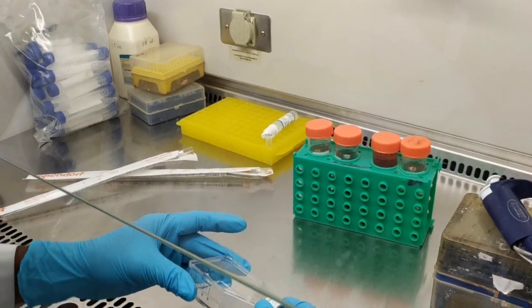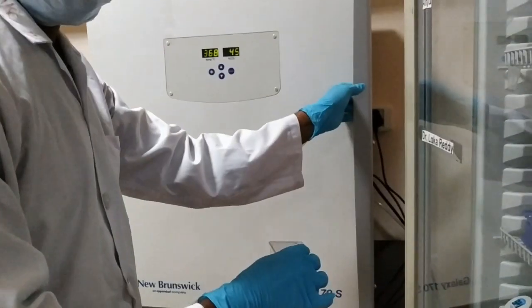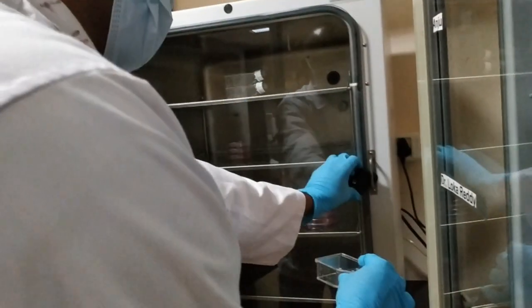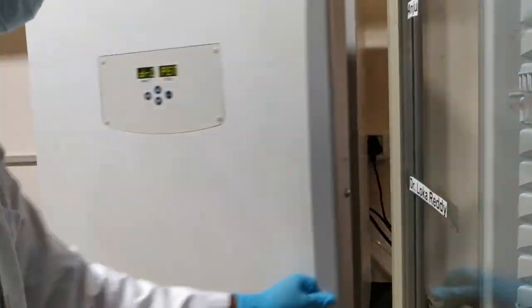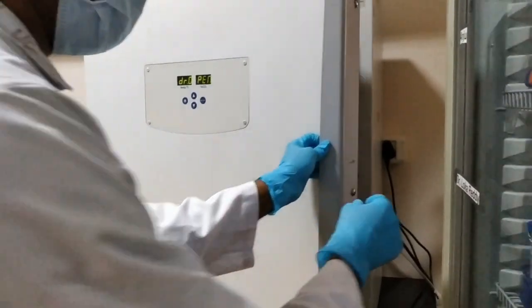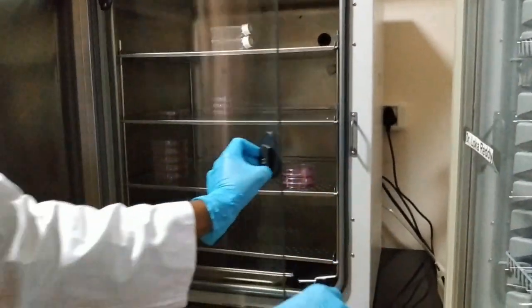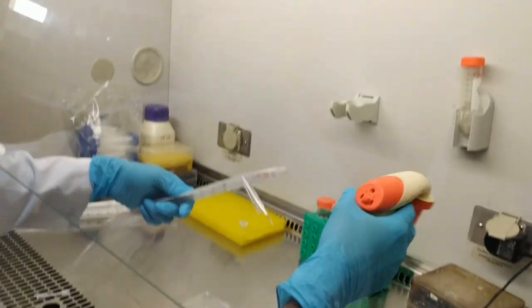To increase the dissociation efficiency of the trypsin, the optimal temperature should be 37. Hence, I am keeping the cell containing vessel inside the 37 incubator. So I'm waiting for 5 minutes. After 5 minutes, you can take it out. We can collect the cells by putting some medium, to centrifuge it.